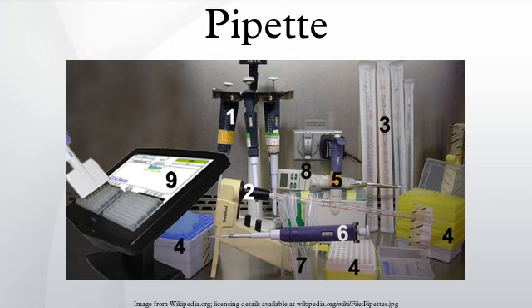Such a device can be used on a wide variety of fluids in volumes between 0.5 ml and 25 ml. This arrangement provides improvements in precision, handling safety, reliability, economy, and versatility. No disposable tips or pipetting aids are needed with the pipetting syringe. Van Slyke pipette, a graduated pipette commonly used in medical technology with serologic pipettes for volumetric analysis. Invented by Donald Dexter Van Slyke.